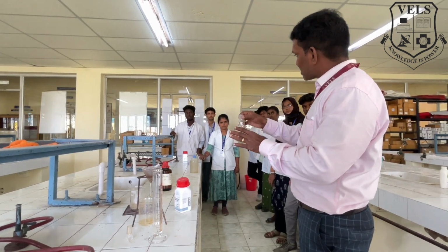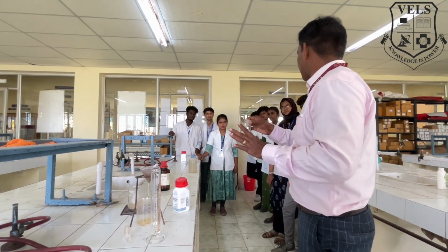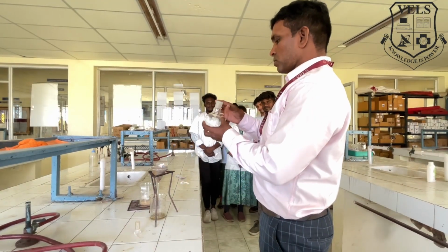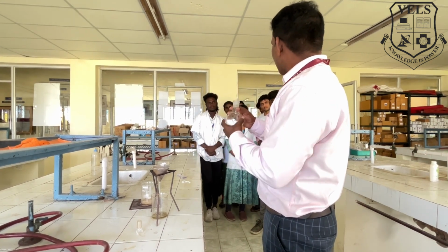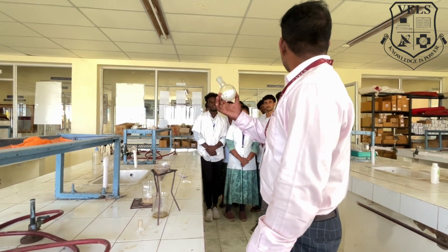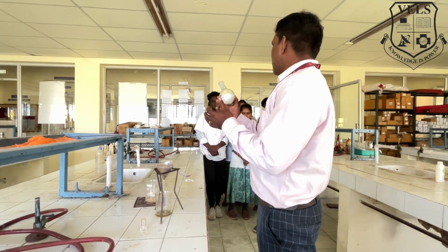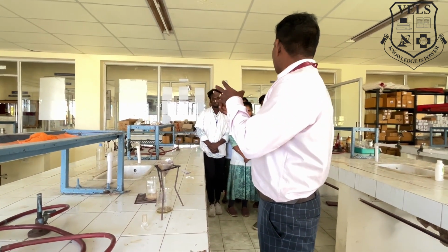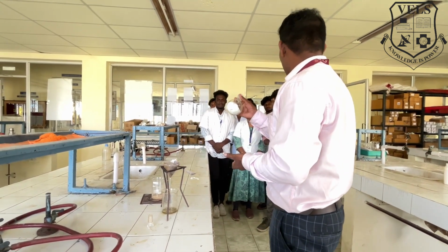After evaporation, we will see the caffeine. We took this chloroform extract, evaporated it, and got the crude product of caffeine. In order to convert this to pure caffeine, you have to do the recrystallization process.